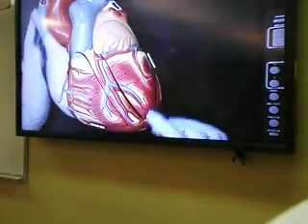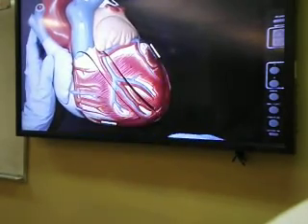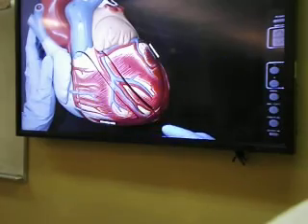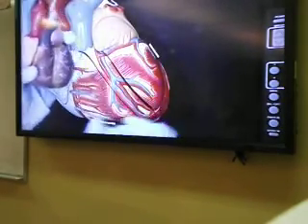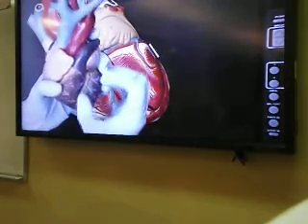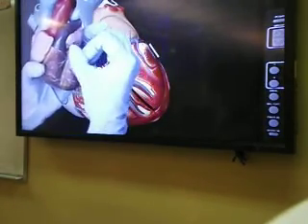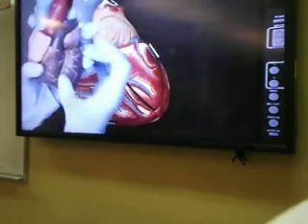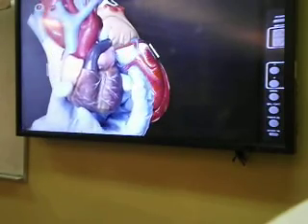A small other thing that we still need to know is this: when we are looking at the anterior view of the heart, which is also well seen from the smaller model, we see there is a groove that almost starts from the area where the left atrium is and ends anatomically right of the apex, if you are looking from the anterior view of the heart.